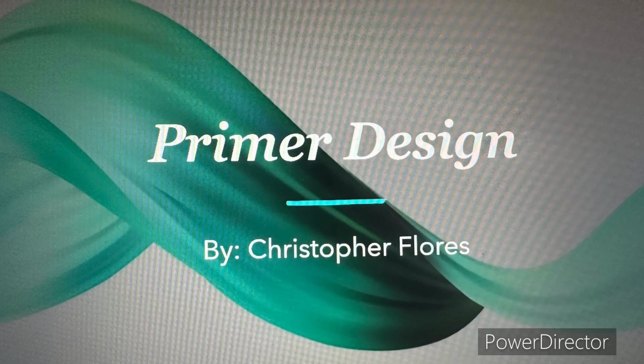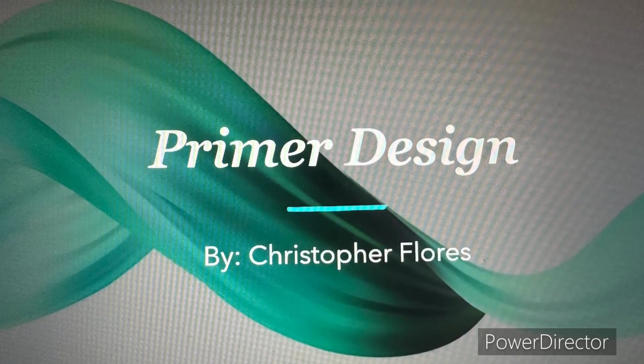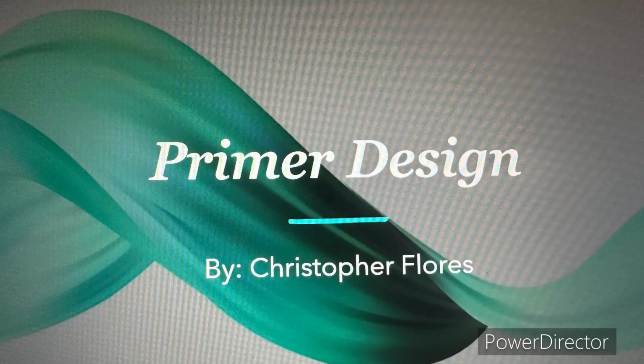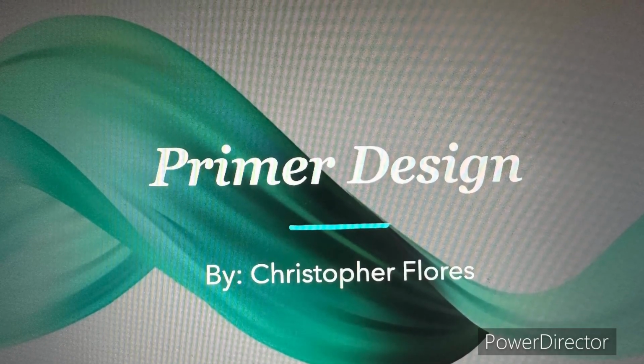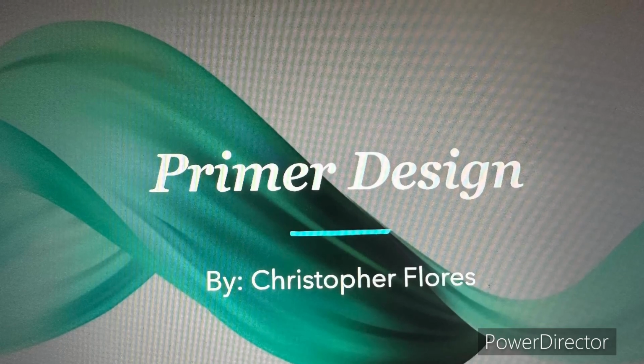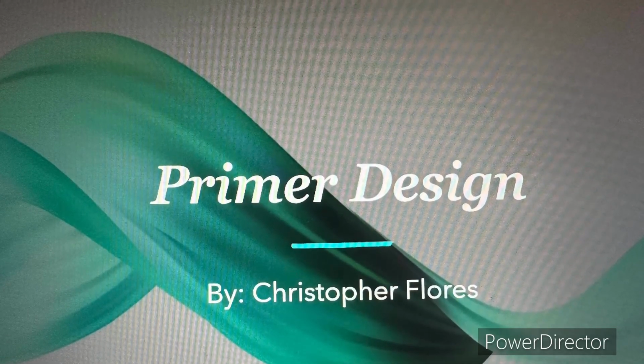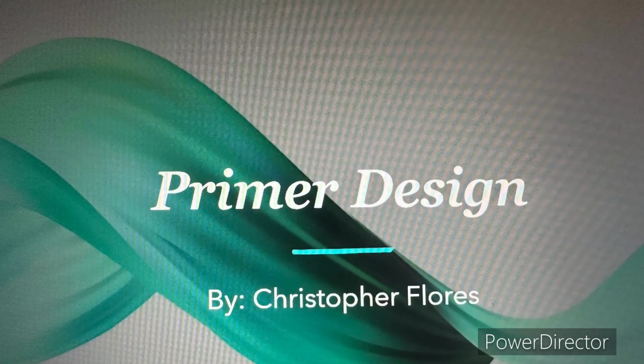The purpose of primer design is to create short, specific sequences of nucleotides that can selectively bind to a particular target DNA or RNA sequence. It is a critical step in many molecular biology applications as it allows researchers to generate accurate and specific results by ensuring that the primers only bind to the intended target sequence.